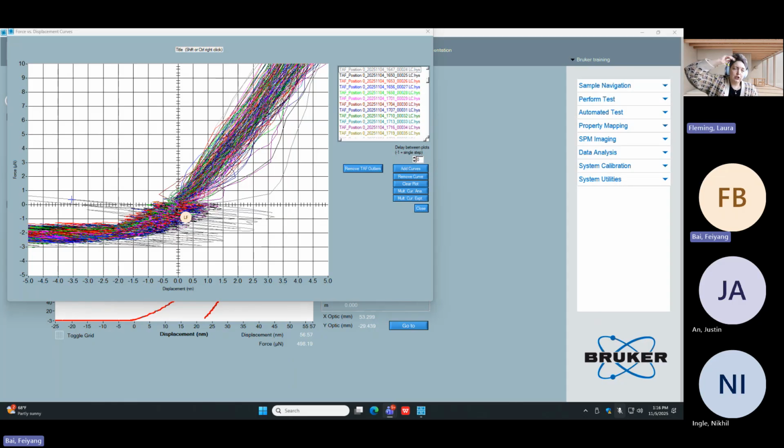Yes. The 2 micronewtons you're thinking of is the contact force it must feel in order to determine that it's in contact with the sample. Those two facts combined means that what we have here is not the real 0 point. So this is where the indent begins. And then it comes and it lifts out of contact. And what you can see here is that the force is still decreasing during the lift until this point. And then here, the force is truly 0, right? The force is flat. The force is no longer changing as a function of the displacement. That means that force must be the 0 force during the lift. It's offset by 2 micronewtons because of that contact threshold.